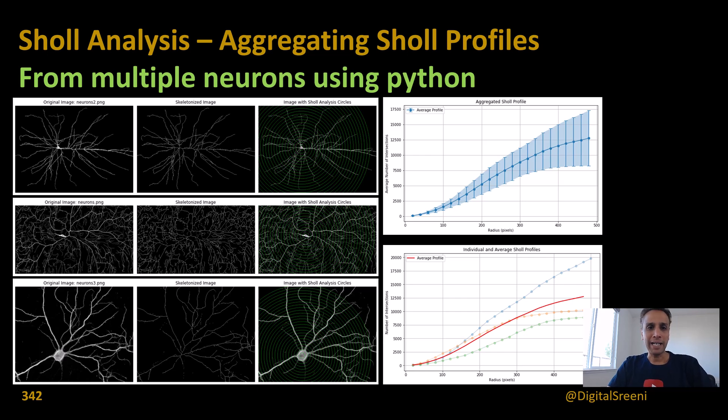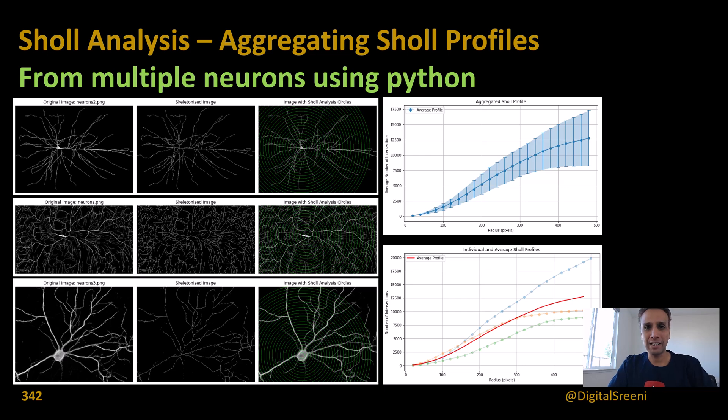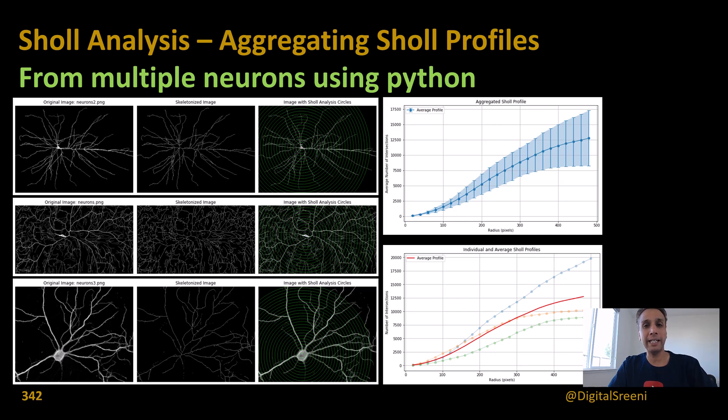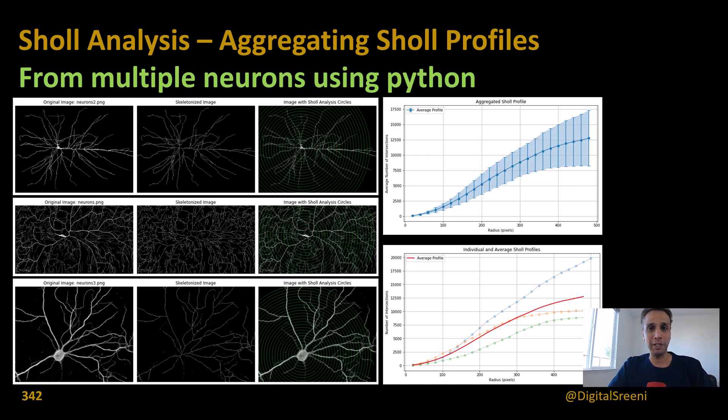Hi everyone, welcome back. This is a continuation of our discussion from the last tutorial where we looked at how we can use Python to semi-automate Sholl analysis. I say semi-automate because fully automated is not completely reliable in detecting soma automatically. So we said okay, let's do that part manually and then go ahead and perform the Sholl analysis.